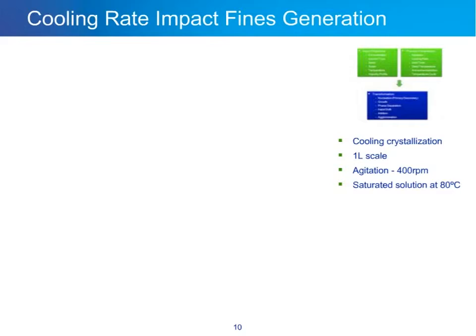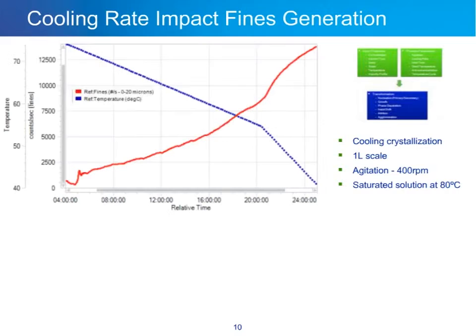This is a cooling crystallization at one-liter scale, with agitation at 400 RPM and a saturated solution at 80°C. Many examples today come from the pharmaceutical industry, so we can't go into a lot of detail about what the compound is, but we can show the trends. On the FBRM trend, the x-axis is time. There are two y-axes: fine counts measured by FBRM and temperature. We see a slow cooling rate over the first 20 hours, then an increased cooling rate over the final four hours. Right at the point where the cooling rate increases, we see an increase in the fines generation rate.